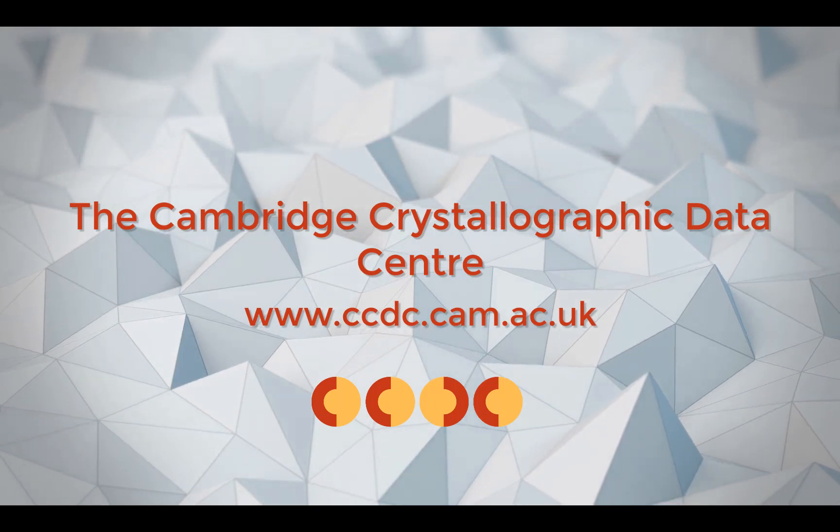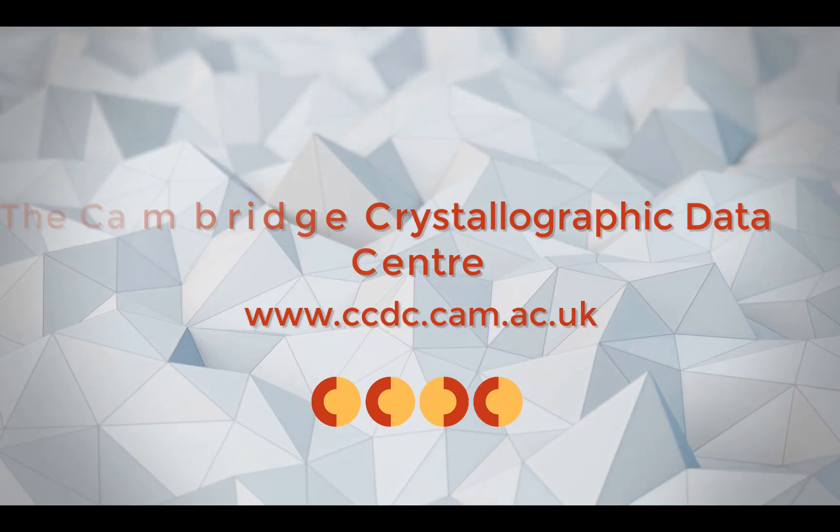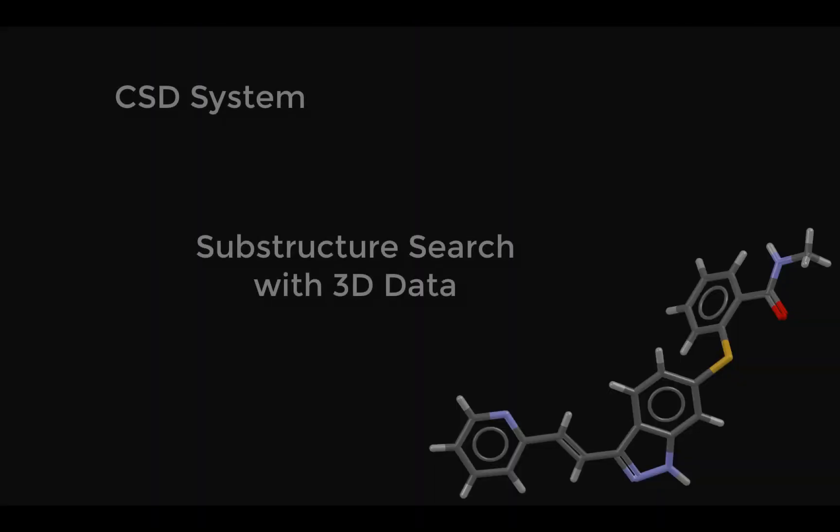Hi! This is Amy Sargent, doing outreach and education for the CCDC. Today, I'm going to show you how to use Conquest to do a substructure search with 3D data included. Let's get started!